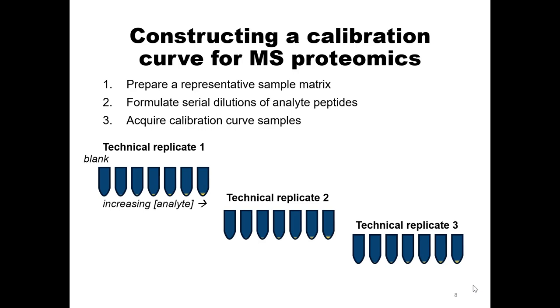Any more questions about this? I think that's calculating dilutions can be very tricky, especially because you need to make sure each one of these curve points has enough volume, and if you're drawing from an upper curve point to do a serial dilution for a lower curve point, you need to make sure you account for that when you're doing your math. I think that's everything that comes to the top of my mind for what I've messed up in curve points before.